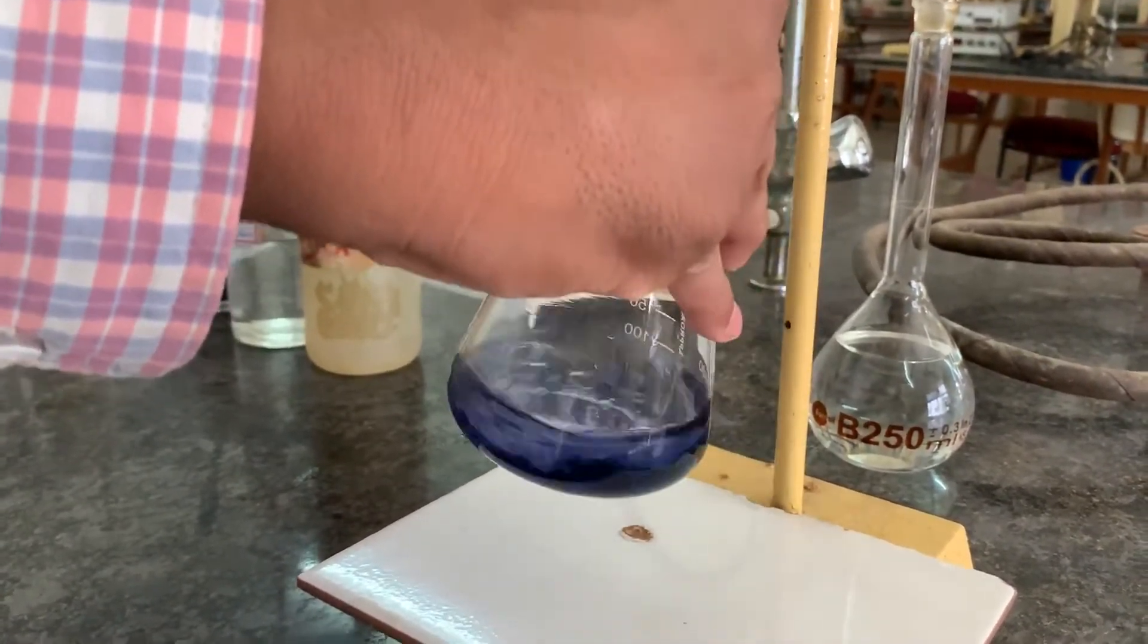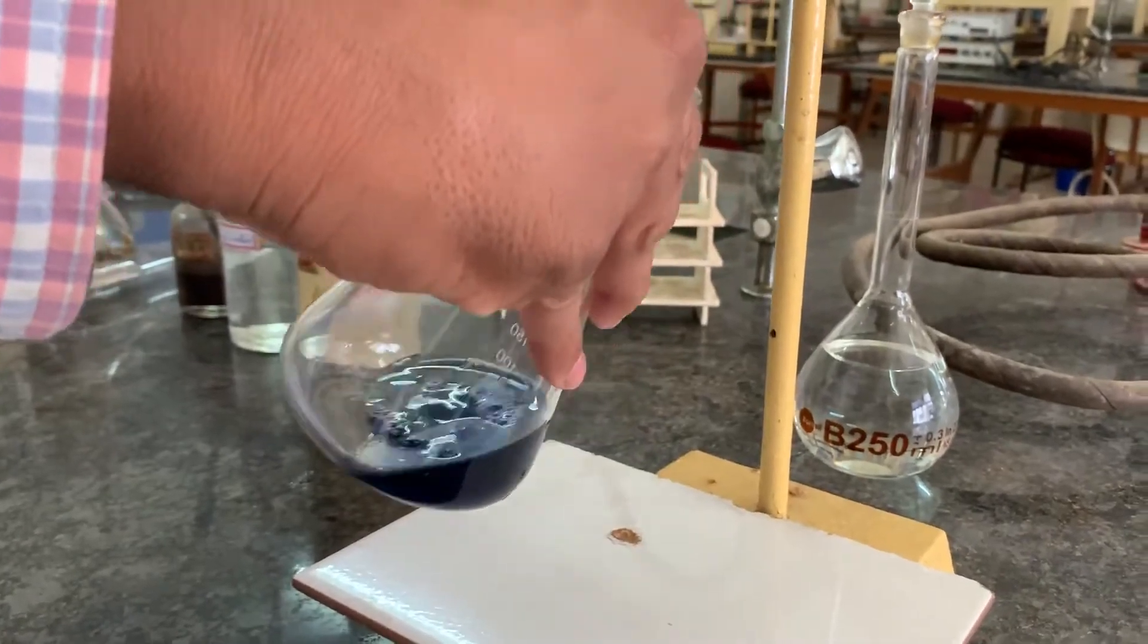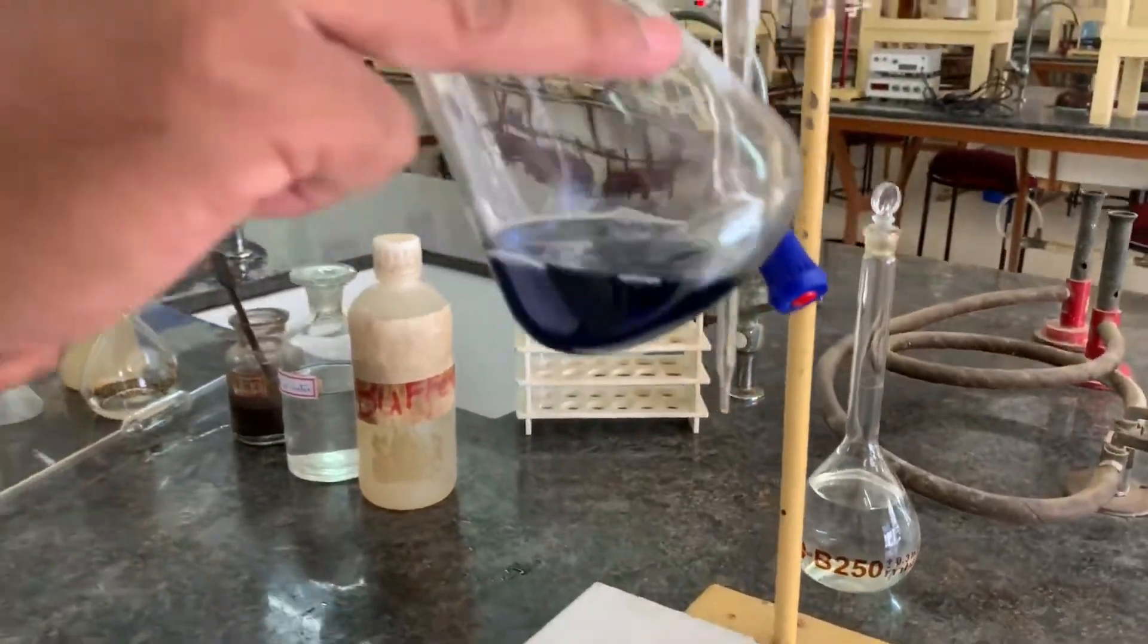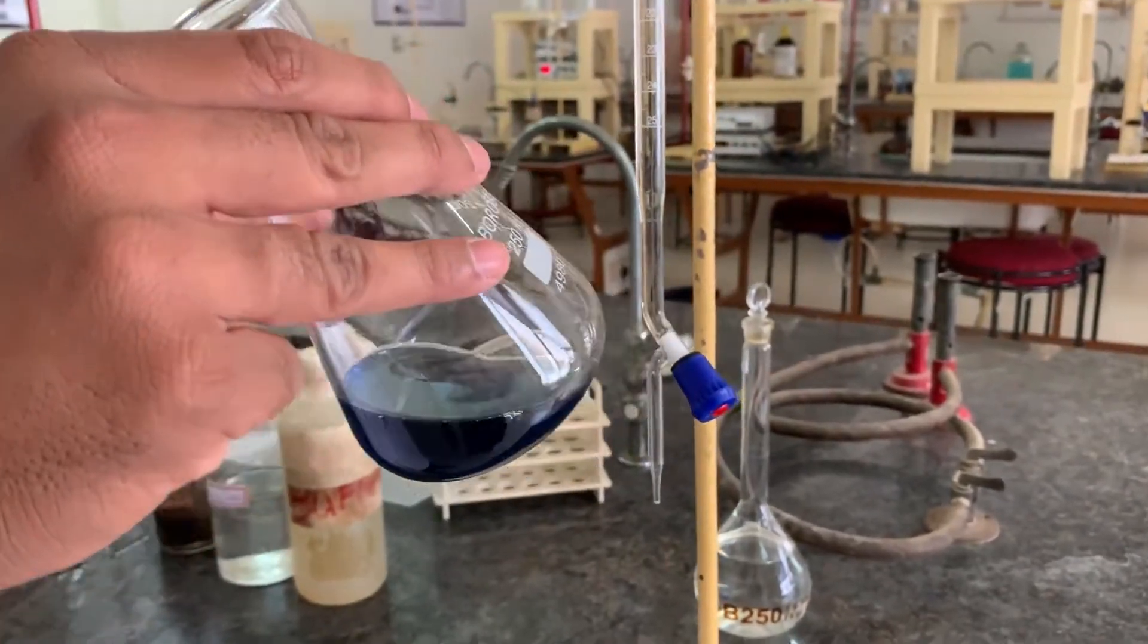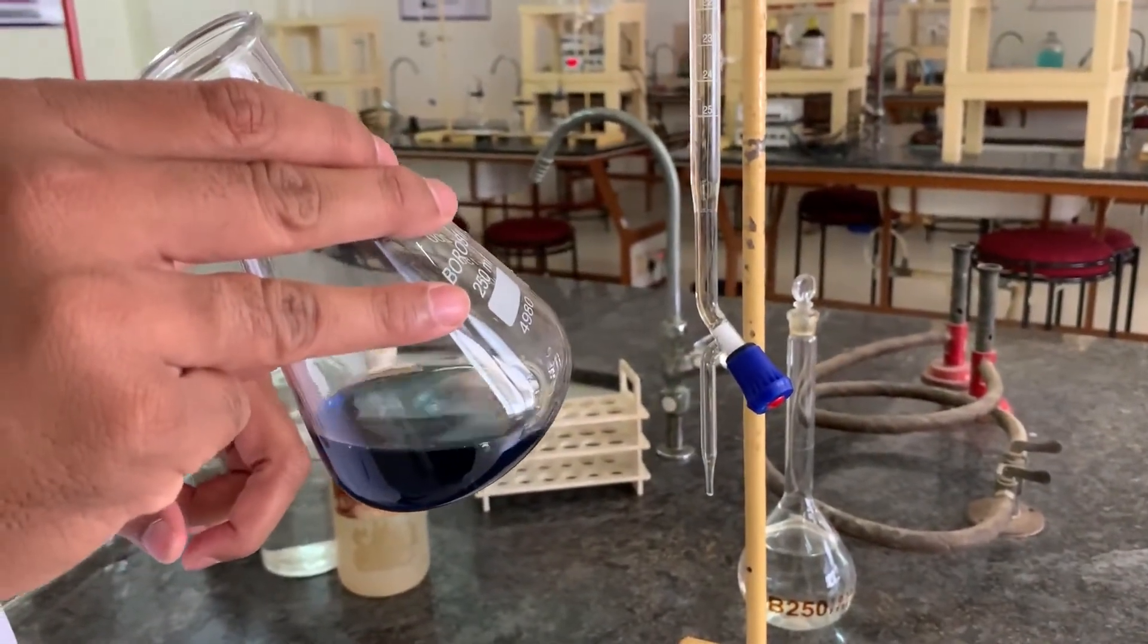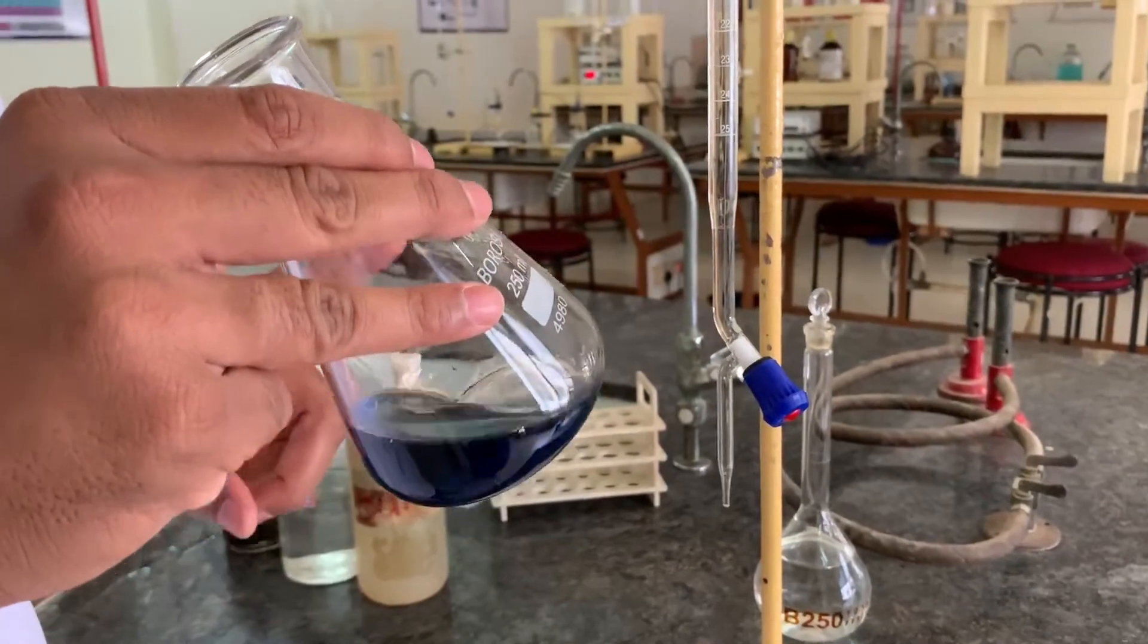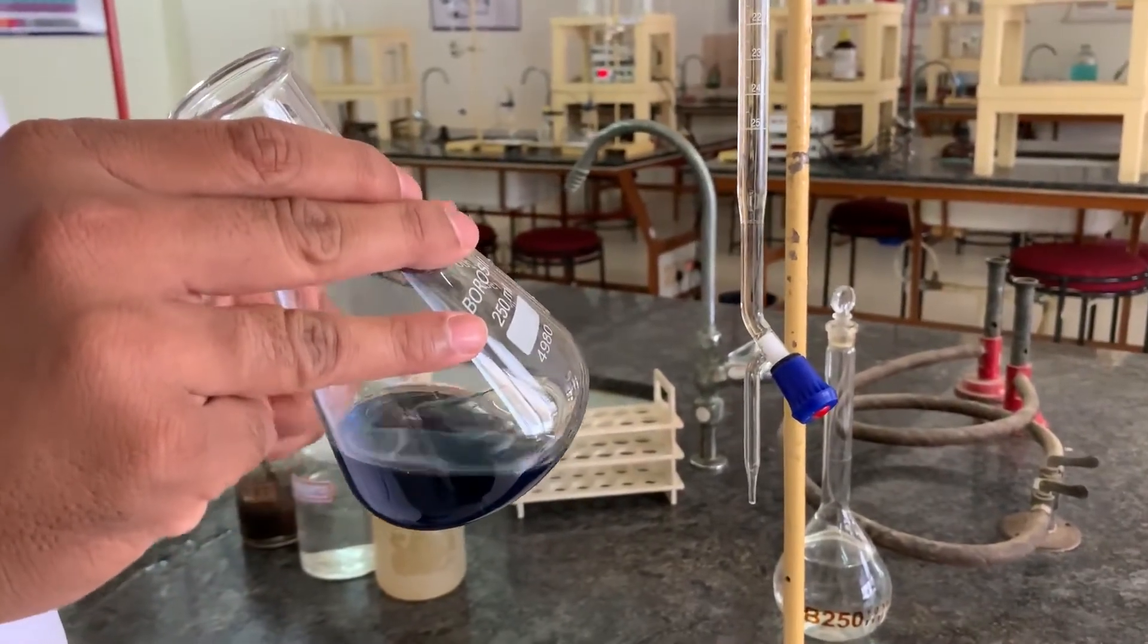You can observe that the color of the solution changed from wine red into clear blue color. This becomes the endpoint. Clear blue is coming because indicator has become free at the endpoint. Now, free indicator EBT is blue in color, that is why we are getting the endpoint from wine red to clear blue color.